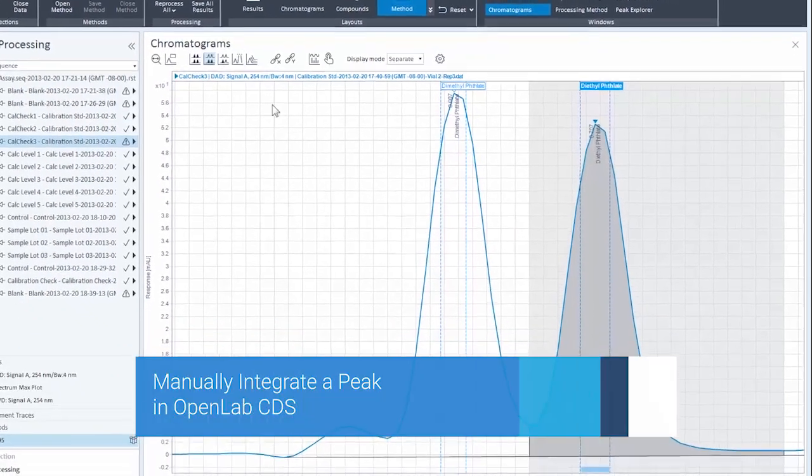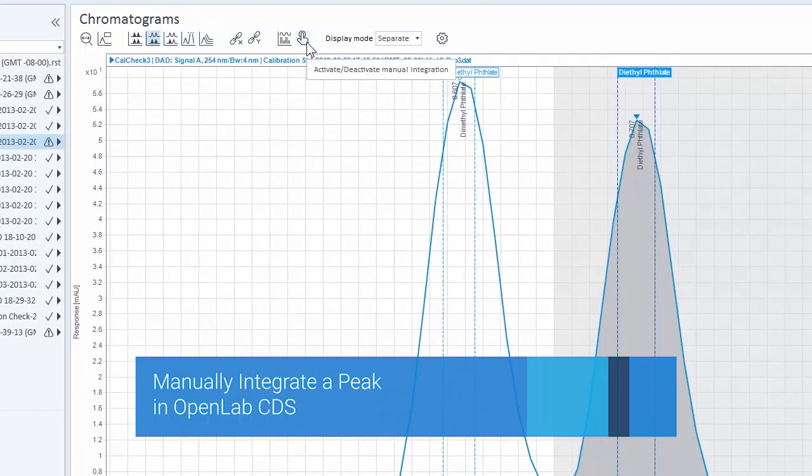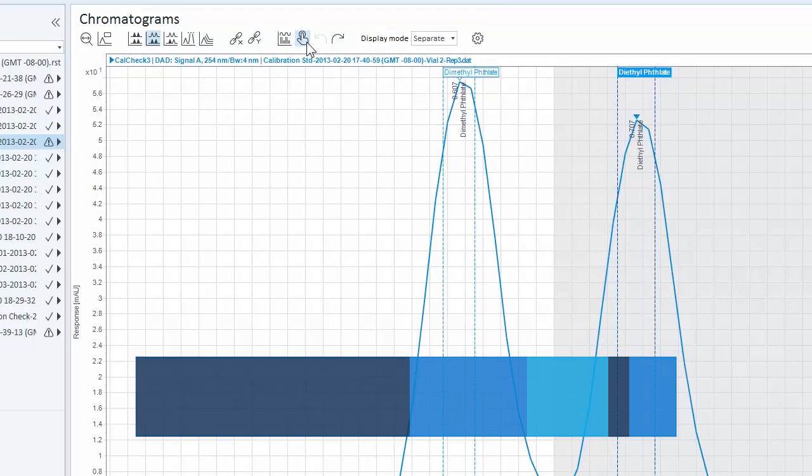As you hover over different areas of your chromatogram, you find a variety of actions are indicated by the manual integration cursor.